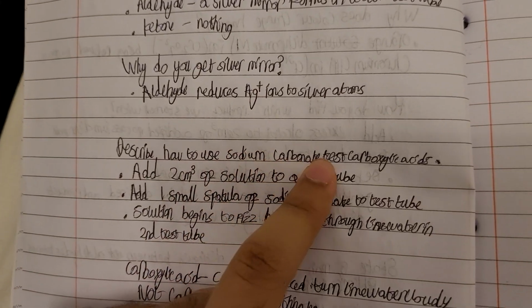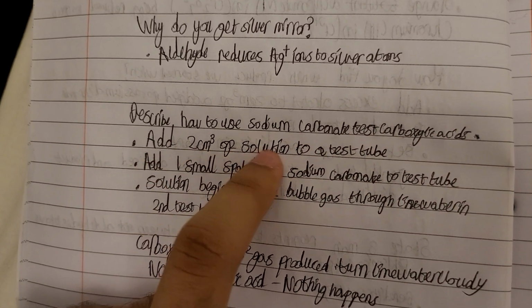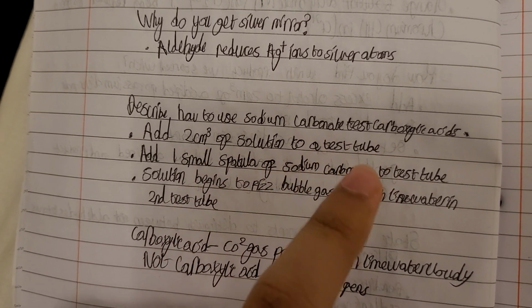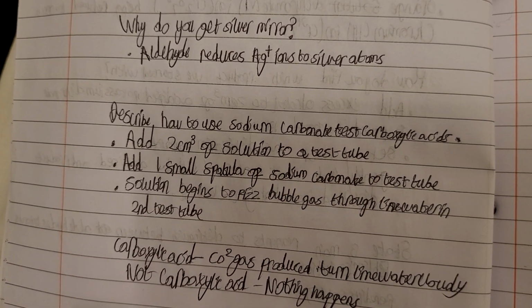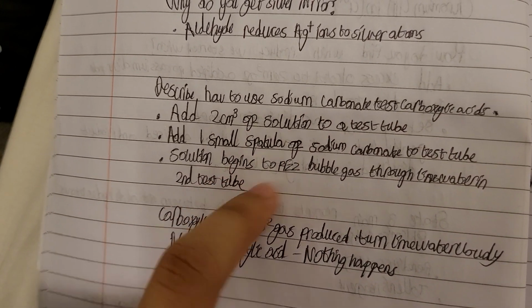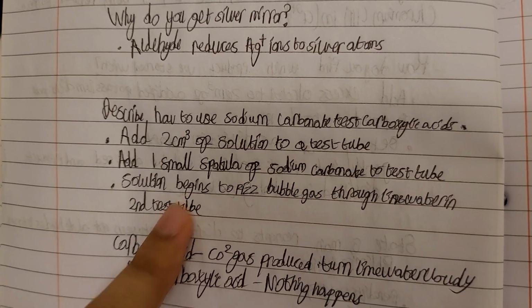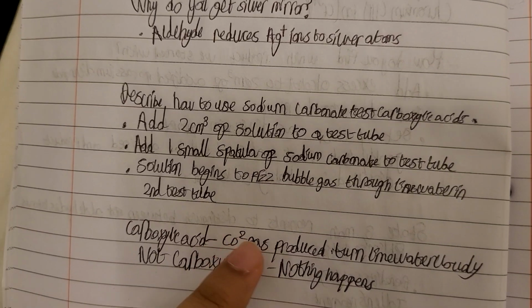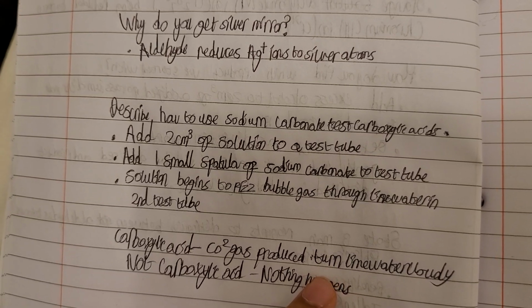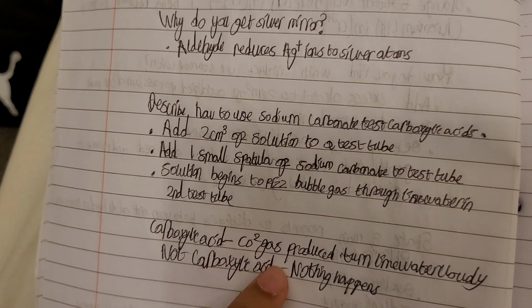Describe how to use the sodium carbonate test for carboxylic acids. We add 2 centimeters cubed of the solution we want to test to a test tube. Then add one small spatula of solid sodium carbonate to the test tube. If the solution begins to fizz, bubble the gas through lime water in a second test tube. If it's a carboxylic acid, the solution will begin to fizz, and the CO2 gas produced will turn the lime water cloudy. If it's not a carboxylic acid, nothing happens.